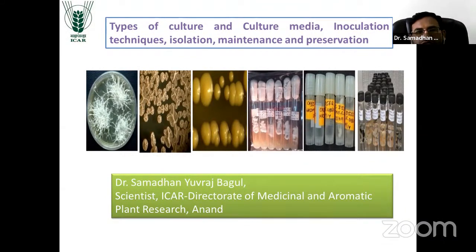So the topic given to me is types of cultures, culture media, inoculation technique, isolation, maintenance, and preservation. This is a very basic topic. Everyone in microbiology starts from culture, isolation, purification, and their preservation and maintenance. So the microbiologist and pathologist has to work on this aspect.